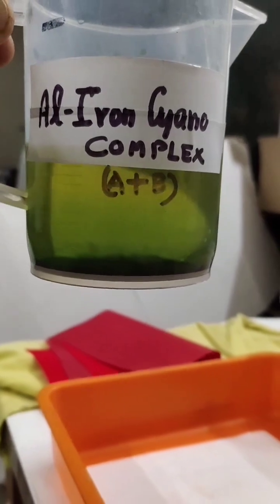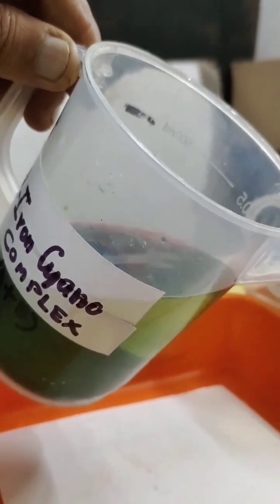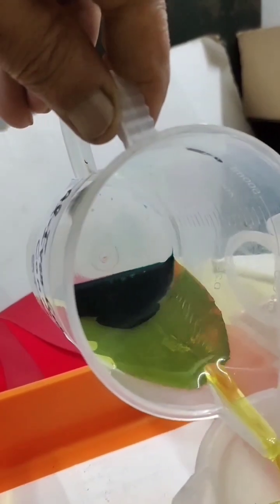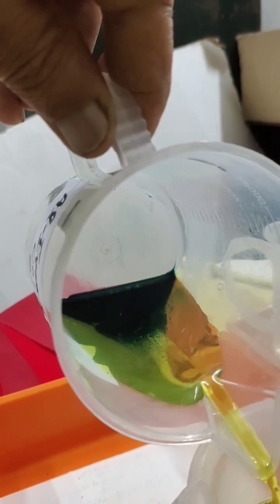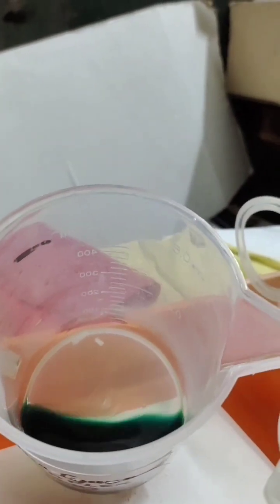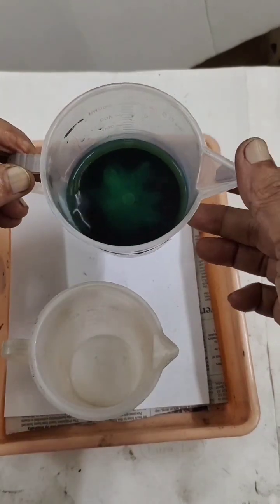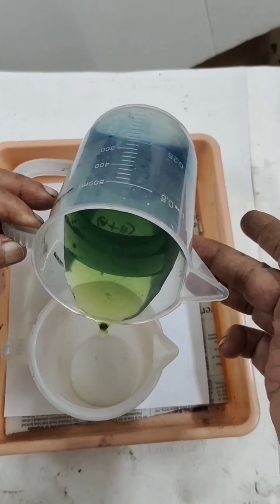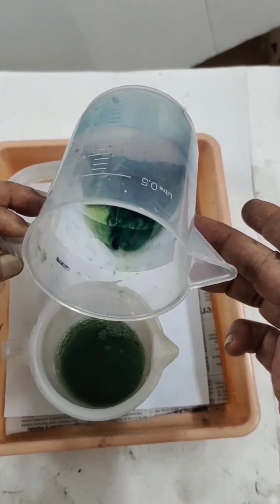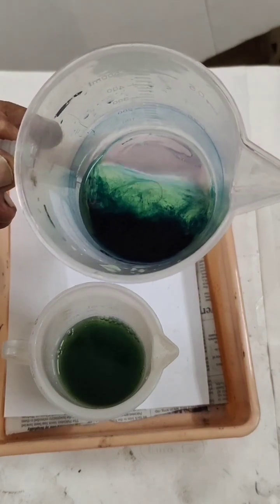Now the aluminum iron cyano complex has formed and you can see it settled at the bottom. The upper layer I will slowly remove by decanting — this is a simple method. The cyano complex is at the bottom. The upper layer I am slowly removing. Some sediments are coming up, so I will add distilled water again and allow natural decantation. This is the second time I am taking out the clear upper layer, separating it from the bottom layer which is the aluminum iron complex.